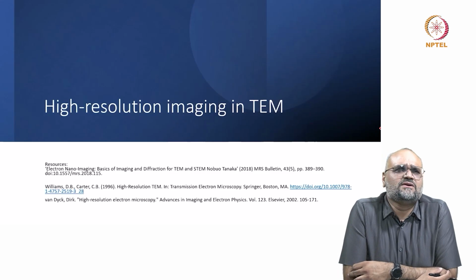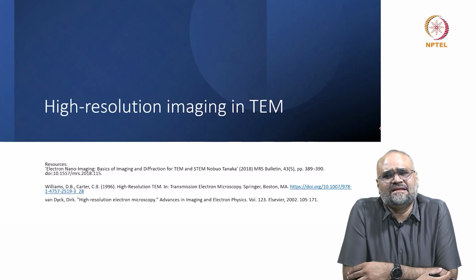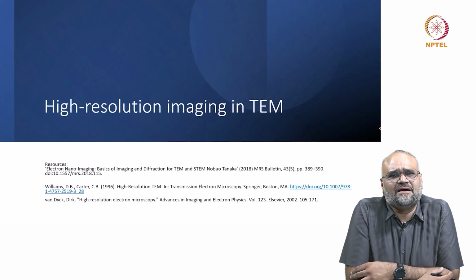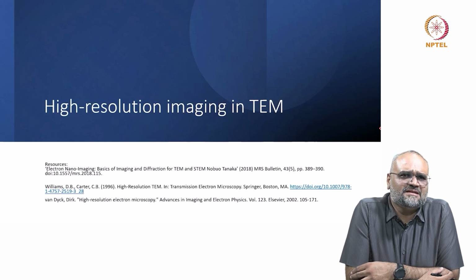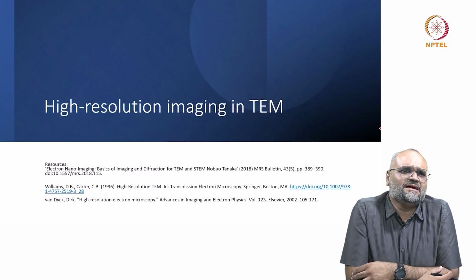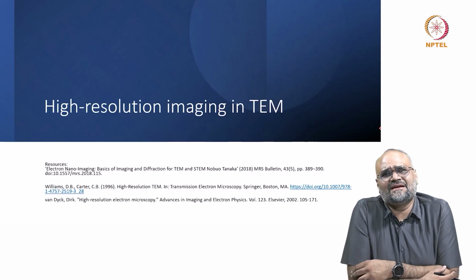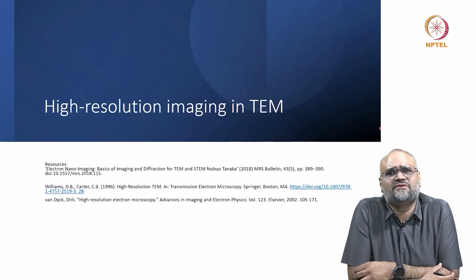Now, before we go into our demonstration sessions on high resolution imaging in two of our microscopes, the JEM 2100 lanthanum hexaboride TEM, we've not been very successful in getting high resolution images from this because of the current state of the filament, and on the JEOL F200 microscope. Although we were not able to successfully get high resolution images, we've still shown the procedure on how you would get on the 2100 instrument and on the F200 instrument.